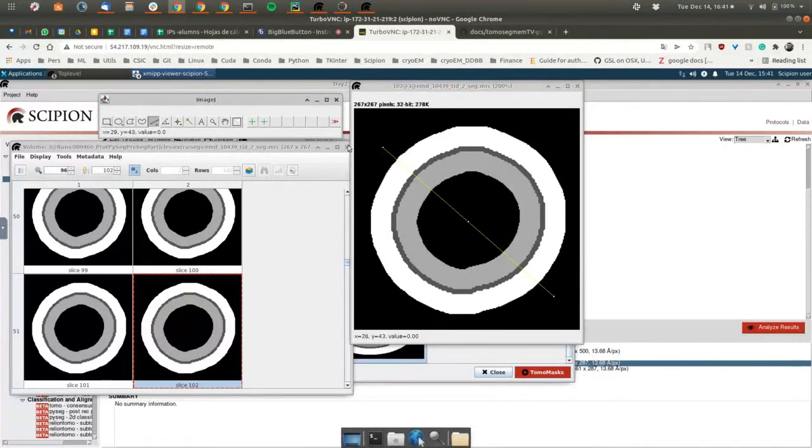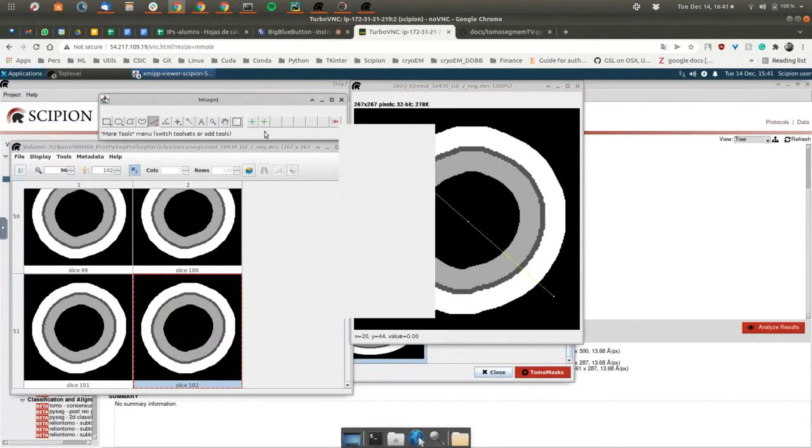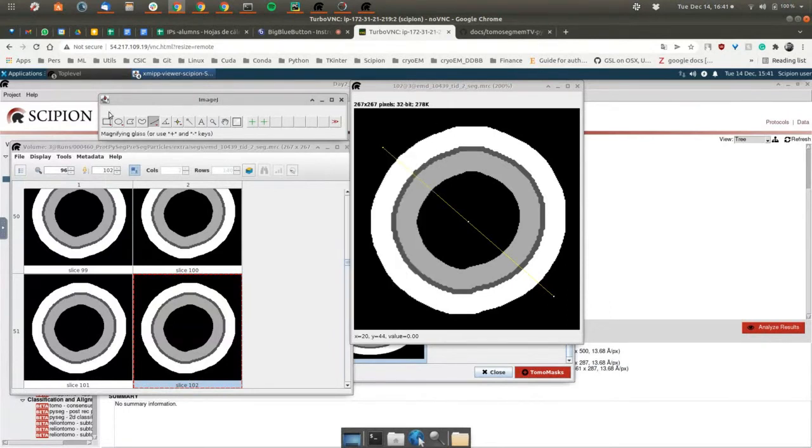It didn't render. Oh, someone from XMIPP is here. I don't know why it didn't render correctly. Oh yeah, now it is here. Maybe there are some rendering problems because the graph calculation spends a lot of the machine's calculation resources, and maybe it's difficult for the machine to work with all of it. I clicked here in the blank space, and after that action it was able to render. But do not worry about this.